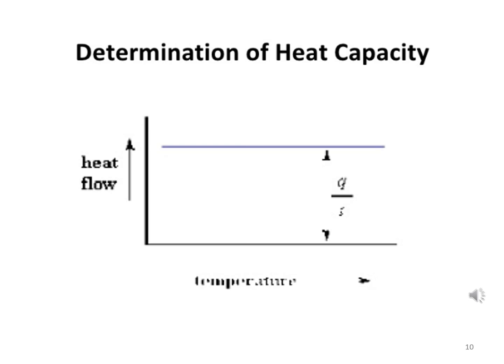When you start heating the two pans, the computer will plot the difference in heat output of the two heaters against temperature. Temperature is on the x-axis, and heat flow is on the y-axis. The plot we get is a plot of heat absorbed by the polymer against temperature. If heat is absorbed, the plot will look like this, as given here. It will be a straight line.